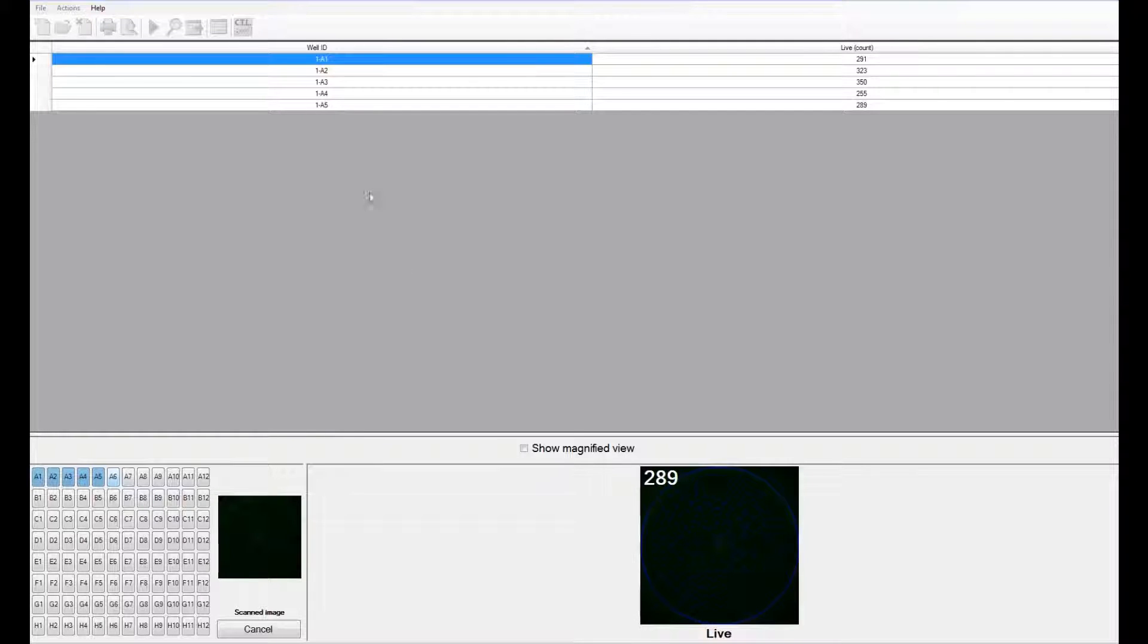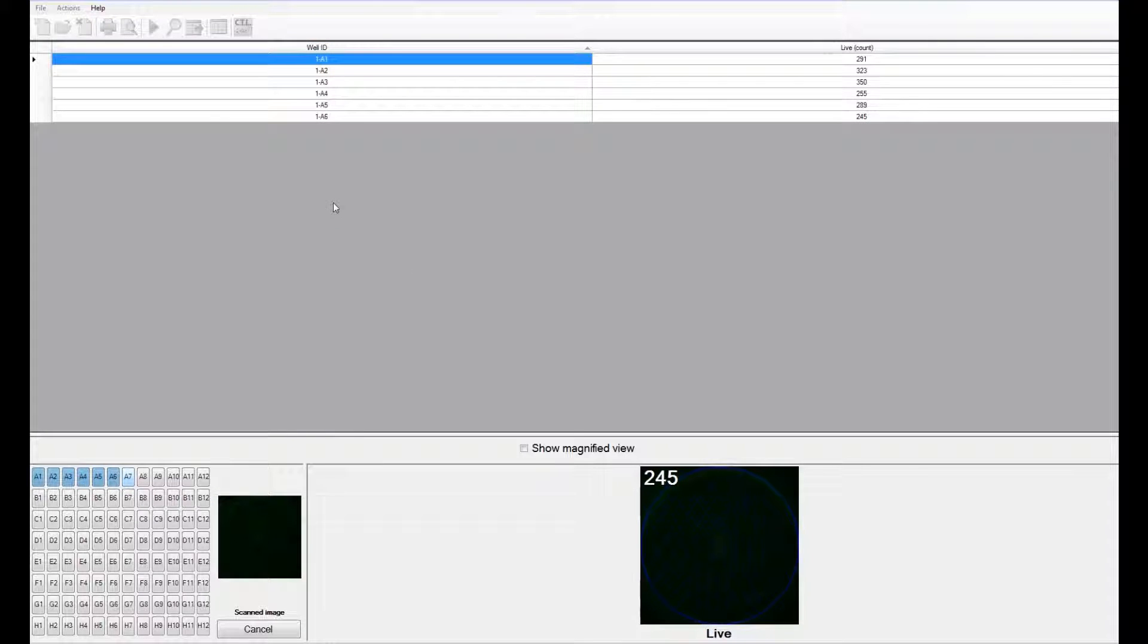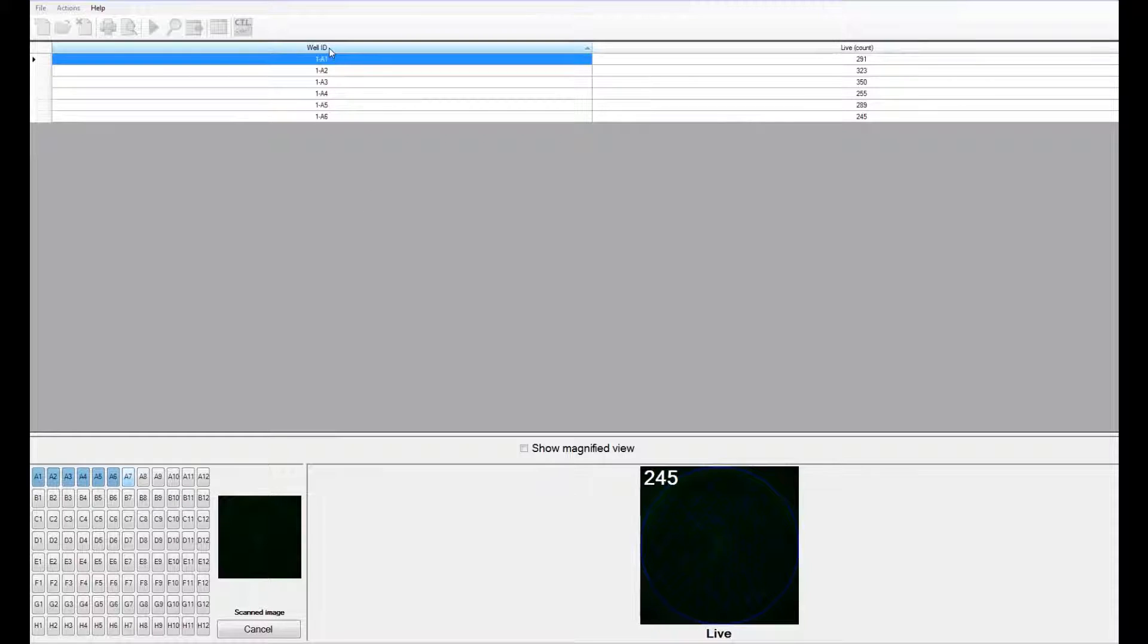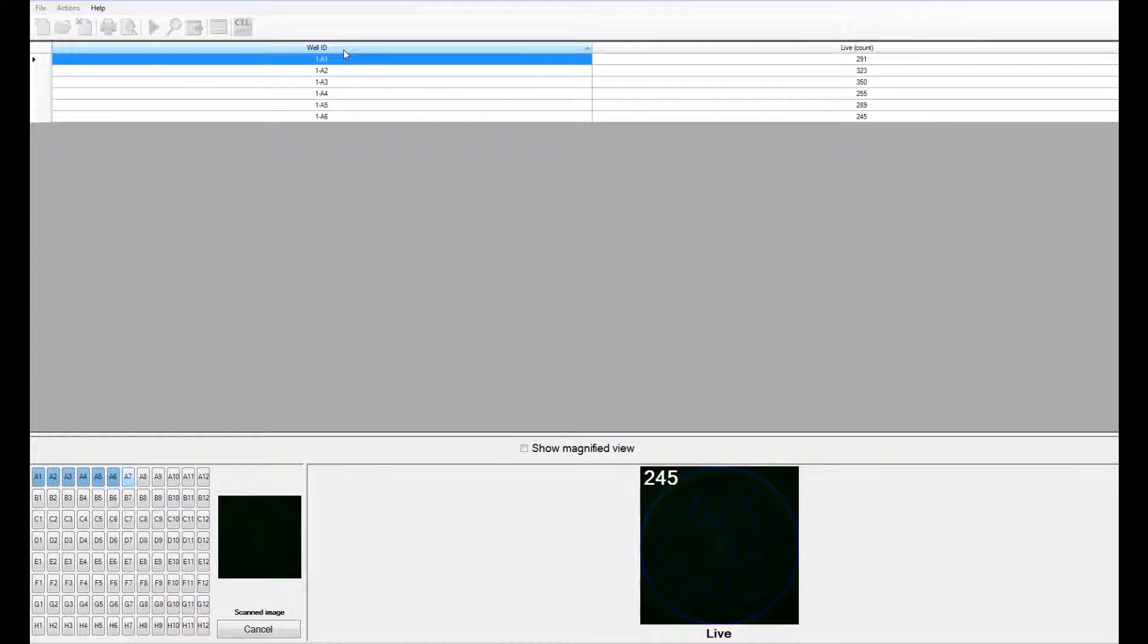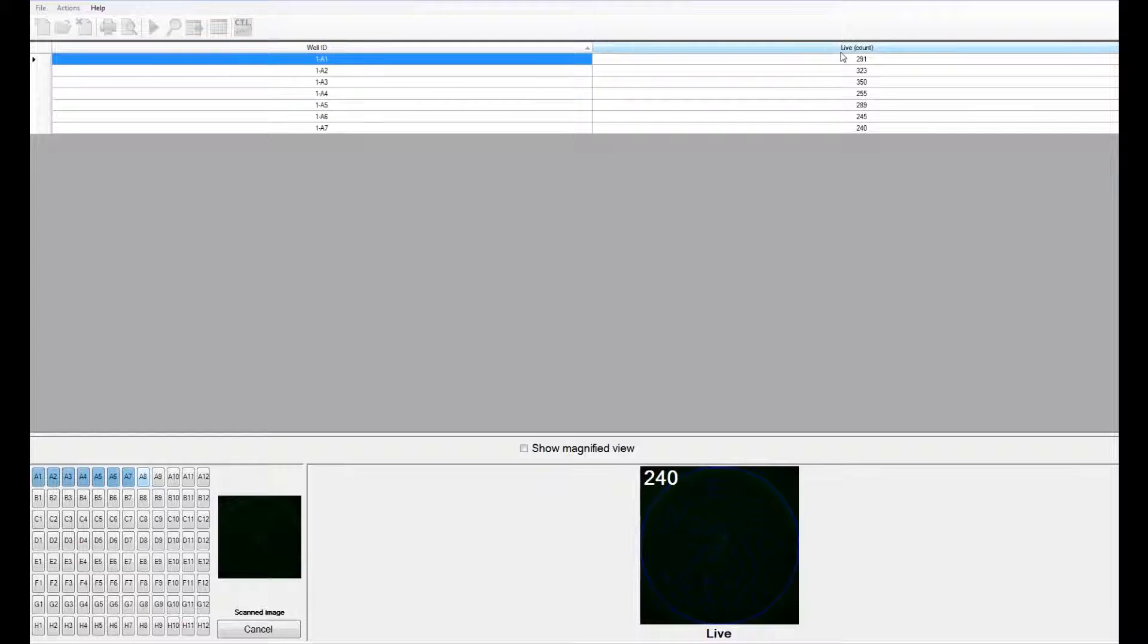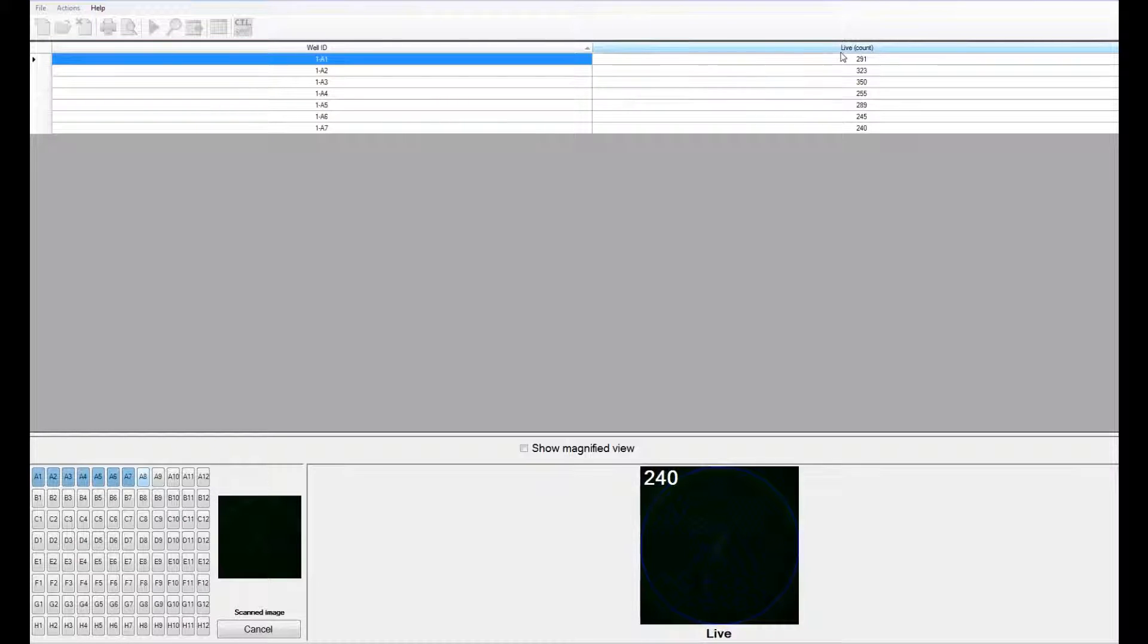You can see that as the software scans and counts, it displays the results on the top. It displays the well ID as well as the live count for each well.